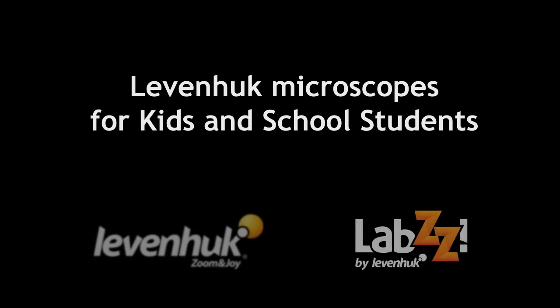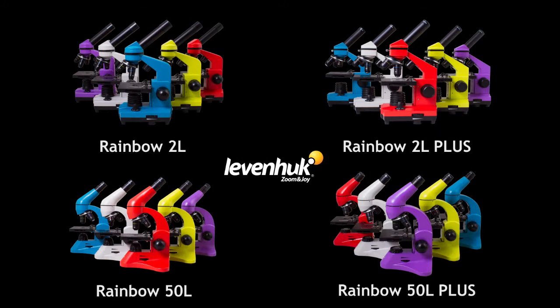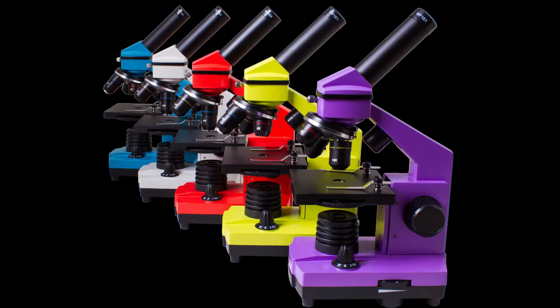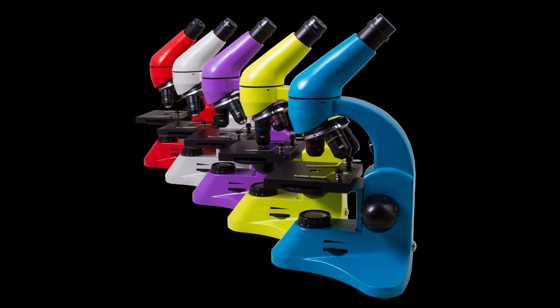In this video, we would like to introduce Levenhuk School Microscopes of the Levenhuk Rainbow and Levenhuk LabZZ lineups. The Levenhuk Rainbow Microscopes include models designed for kids and teenagers and everyone mesmerized by the mysteries of the microcosm. These instruments are great for entry-level observations as well as for basic laboratory studies. The microscope family consists of four series: Levenhuk Rainbow 2L and 2L Plus entry-level microscopes, and Levenhuk Rainbow 50L and 50L Plus microscopes for advanced observers.